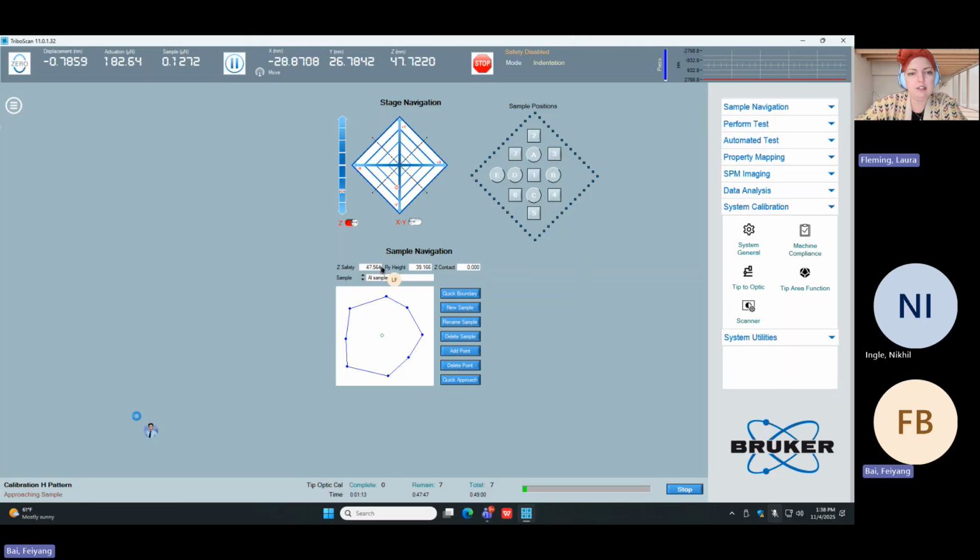And this Z fly height is global, meaning it's for the entire system. It calculates this Z fly height based on the tallest sample's optical focal point. So part of the system safety is that the focal point is actually always lower than the probe. So the assumption is that if you define your tallest sample, I think it takes the tallest sample focal height, and then I think it's like a millimeter, maybe a little bit less. And it defines that as the fly height, so that it always has to move up slightly to move between those automated moves. Does that part make sense?